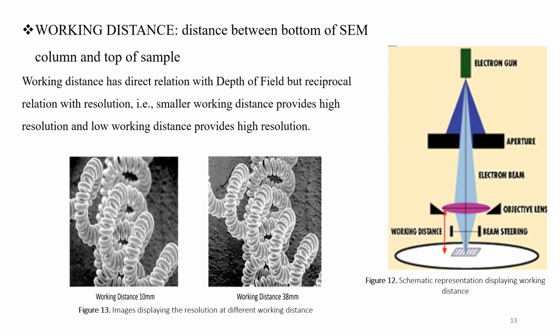That is, as the depth of field is increased, the working distance also increases. But as the working distance is increased, the resolution is decreased. That is, working distance has a reciprocal relation with the resolution.